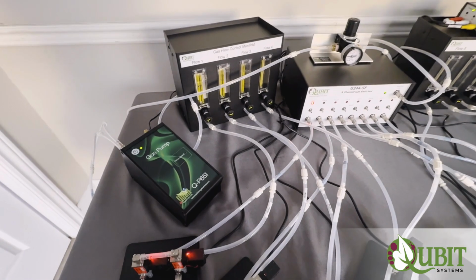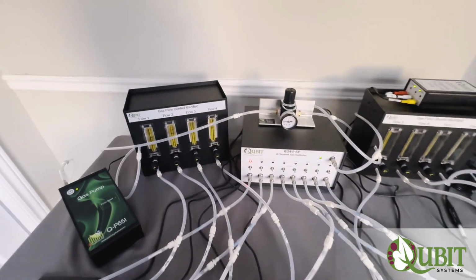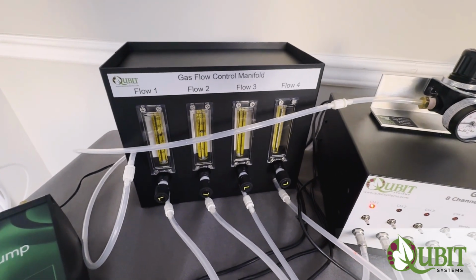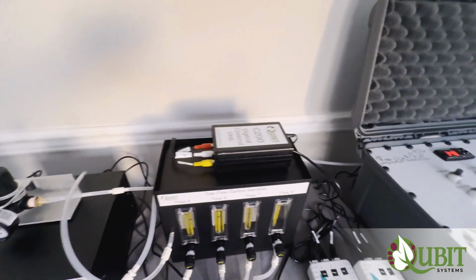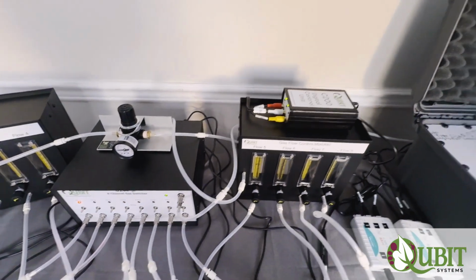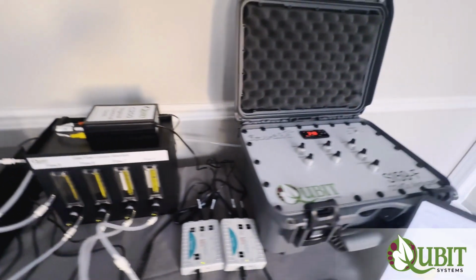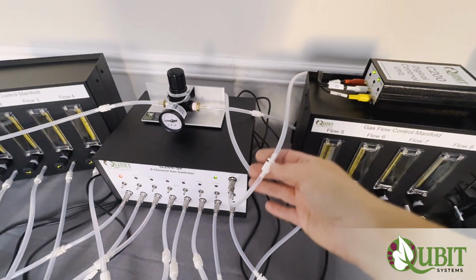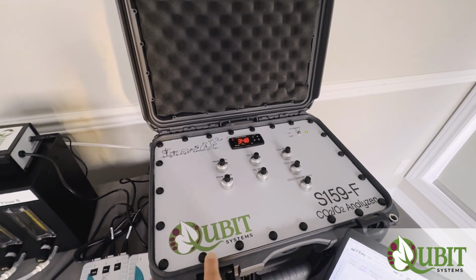And we've got a QP651 pump providing gas to the whole system. The flow meter, rotometers on the gas flow control manifold are where you set the flow. You've got the DCU, which is connected to the gas switcher, and it sends the signal through the software to select various channels. And the gas output from the gas switcher for the selected channel goes to the S159 analyzer, gas analyzer.